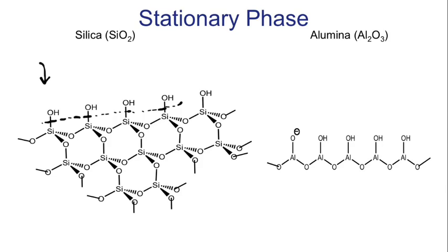If we're concerned how that bond will translate into forces, how can that molecule or that bond interact with a secondary molecule, we would then say dipole-dipole forces. We take that a step further and say, do we have a hydrogen bound to oxygen or nitrogen? In this case, absolutely we do, which means the type of force we would be seeing, based on the drawing we've got here, is hydrogen bonding. How strong of an interaction is that? Okay, it's one of our strongest forces, which would suggest that our stationary phase is quite polar.